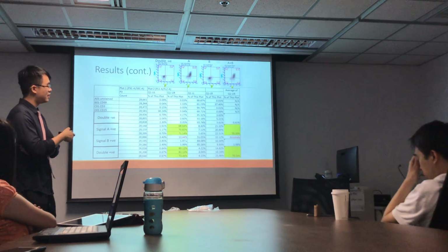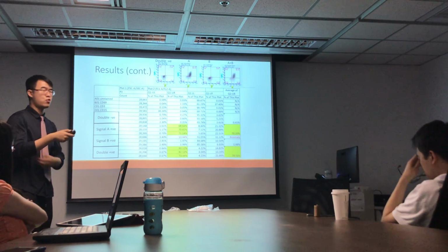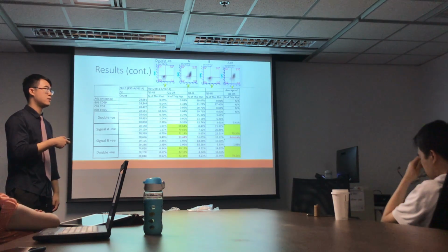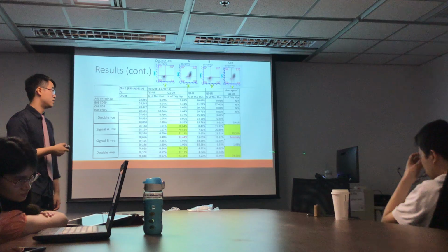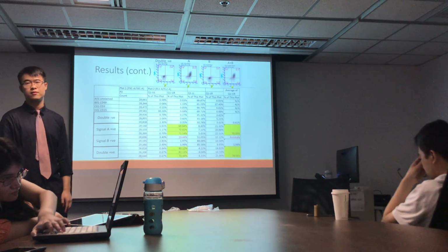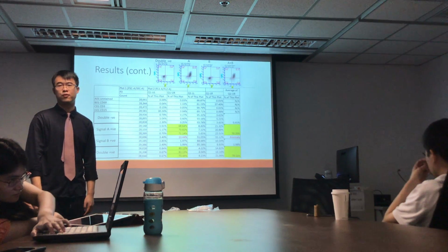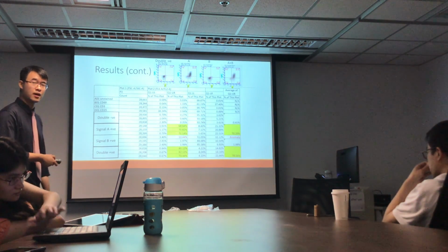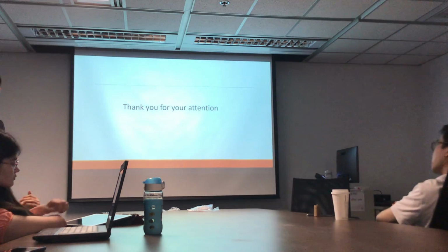We do have notes from doing the experiment, and some suggest that we might have had some error in transferring solutions when we were working with this well, whereas for the other two wells, we don't have any records of possible errors. Oh, so you did record that this well had some. It's possible. Okay. Yes. Then it makes sense. Yeah. And that would be the end of my presentation today. Thank you all for your attention.